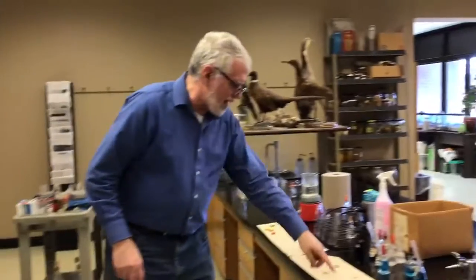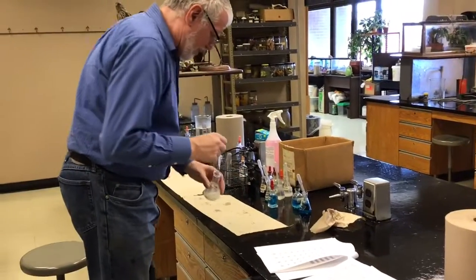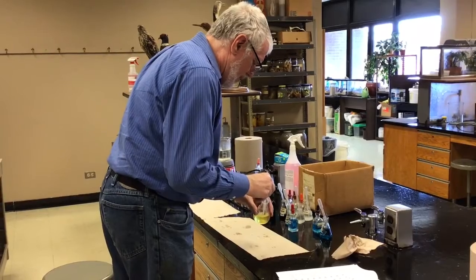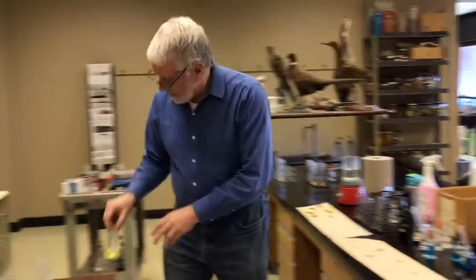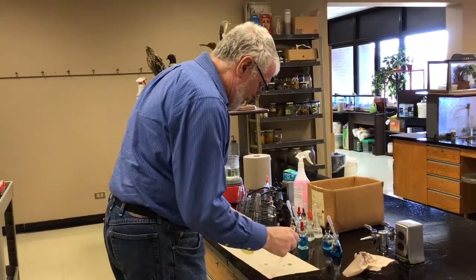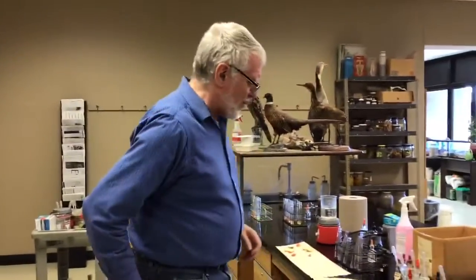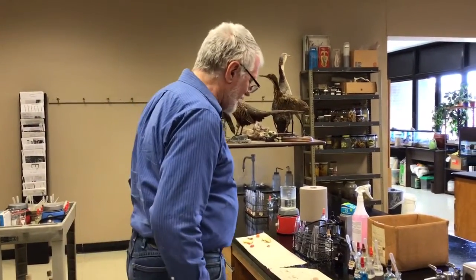Now, I've got a spot on here for milk. I'm just gonna put a small drop of milk. I have a spot for regular soda. I have a spot for diet soda. This is Mountain Dew. I got it because it needs a color control for the Benedict's because it's greenish yellow, which is a positive for Benedict's. And when you mix greenish yellow with blue Benedict's, it turns green, even though that's not a chemical reaction.